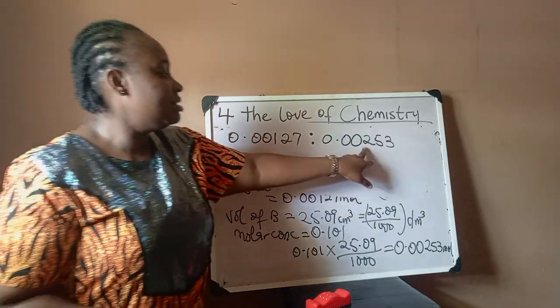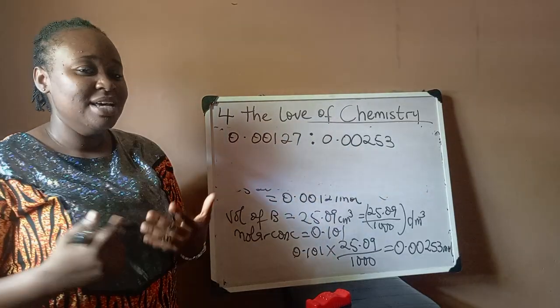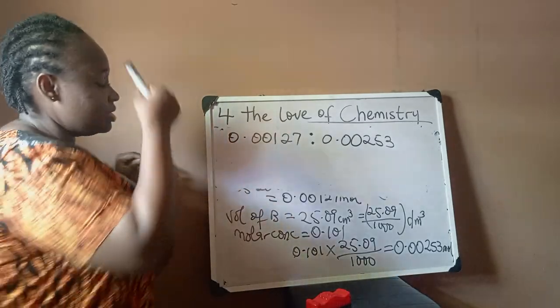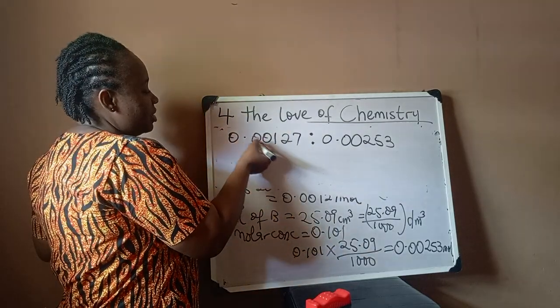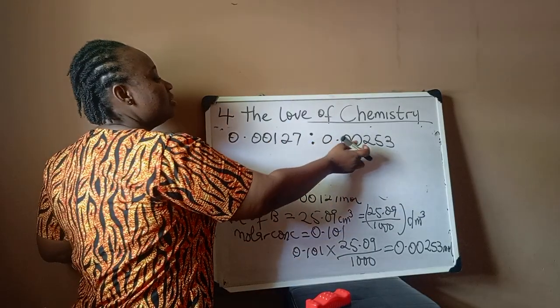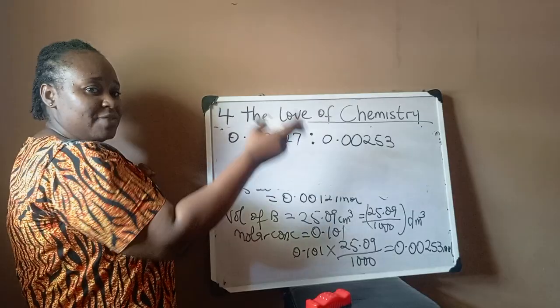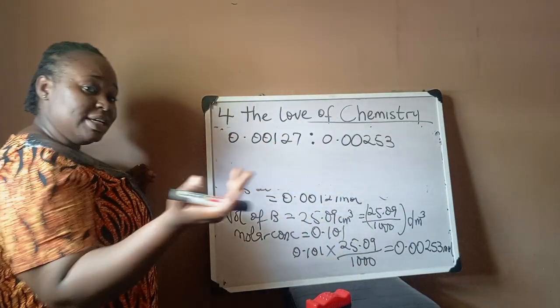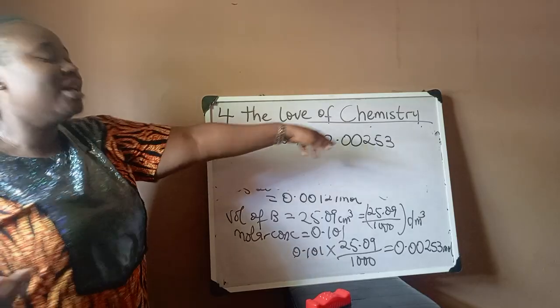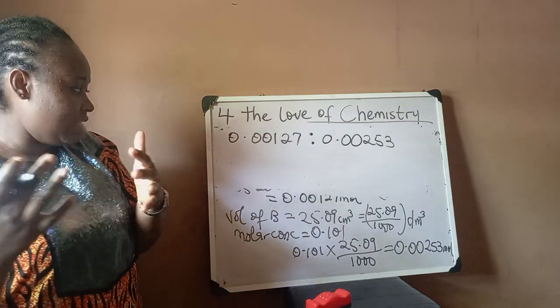So this and this are at the same level. I'm doing this so that if it wants to confuse you, you check it one by one. Because you might see something like 0.01 something, and 0.005, and because you saw 5 as the first number after the point, you think that's the biggest one. But you didn't check the number of zeros in front. That's why I'm emphasizing this.